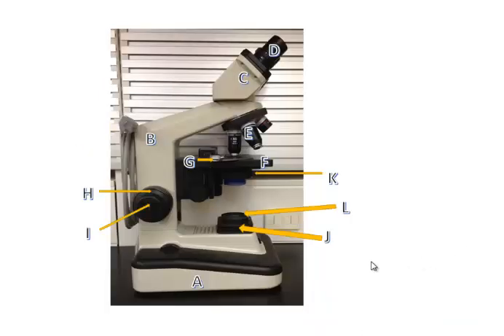In this video we're going to review the parts of the microscope and the functions of those parts. First here we have the base, then we have the arm, and we then have the head or the body tube.